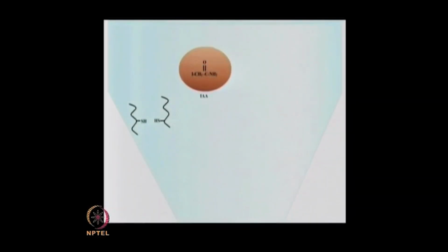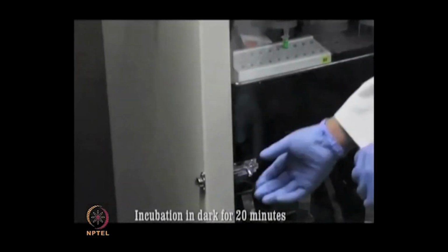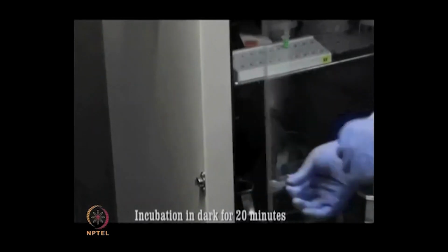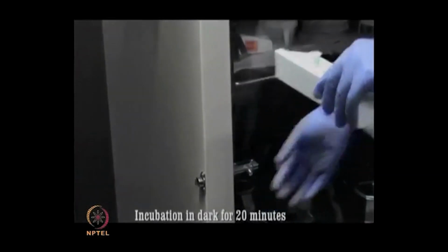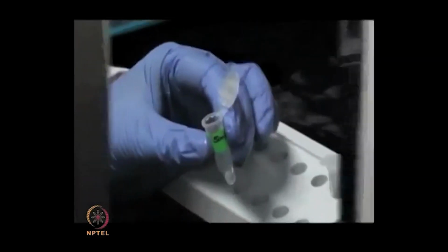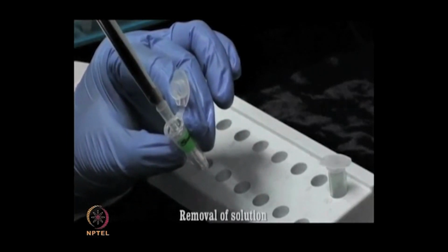The iodoacetamide prevents the reformation of disulfide bonds. It is an alkylating agent. It adds an iodoacetamide group to the sulfhydryl group and prevents disulfide bond formation. Now, your incubation is over. So, you can remove the tubes and now remove the solution.